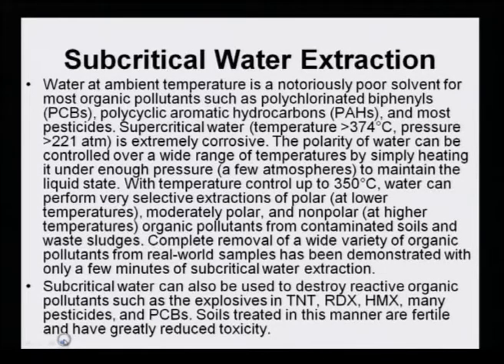Soils treated in this manner are fertile and have greatly reduced toxicity. So, one can do this kind of extraction for soil samples very efficiently, because the extraction process varies from matrix to matrix. It is not a hard and fast rule to use the same extraction method all the time. For groundwater it could be a liquid extraction process, but for ground soil it is another type of extraction process.